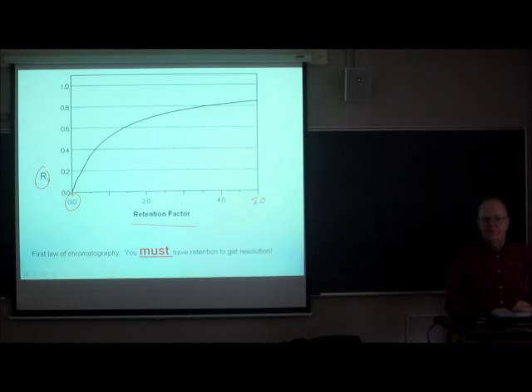It doesn't help. But it makes a lot of difference if your retention is close to the dead time or dead marker or dead volume of the column and there's no retention, and increasing it somewhat makes a big difference. It just goes shooting up. So again, I remind you of the first law. If you don't have retention, you're not going to have resolving power. No matter what else is good, you're dead.